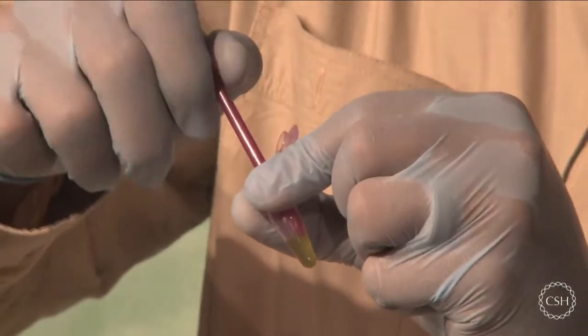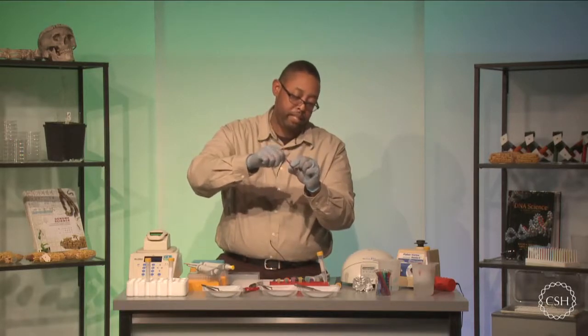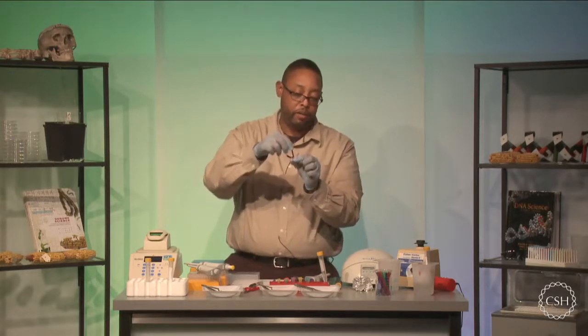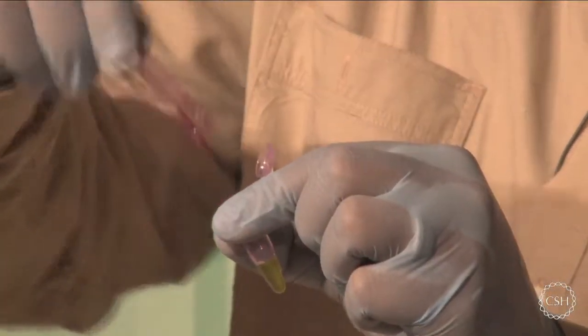Okay, make sure the tissue is pretty well ground up and that the tissue is pretty unrecognizable at the end of this. I will reiterate to forcefully grind while you're in here. Don't give a small amount of grinding up and down. Make sure you're pressing down and twisting very hard. Okay, that's sample number one.